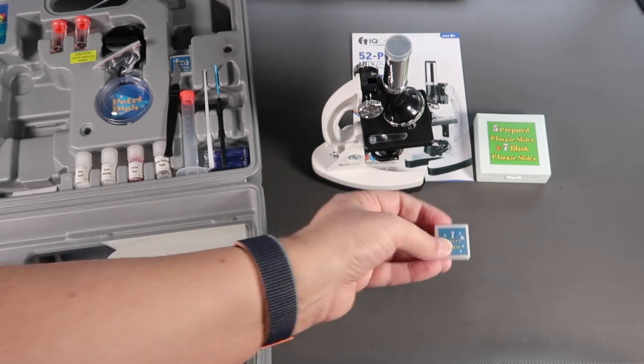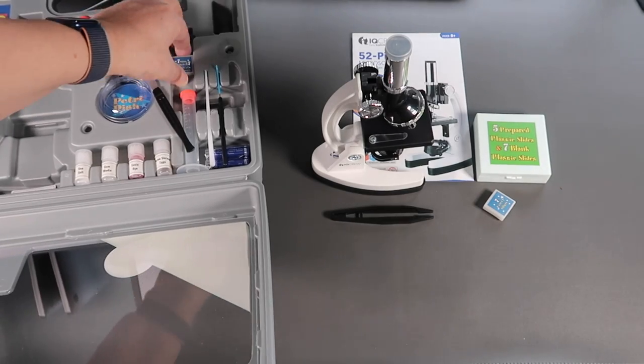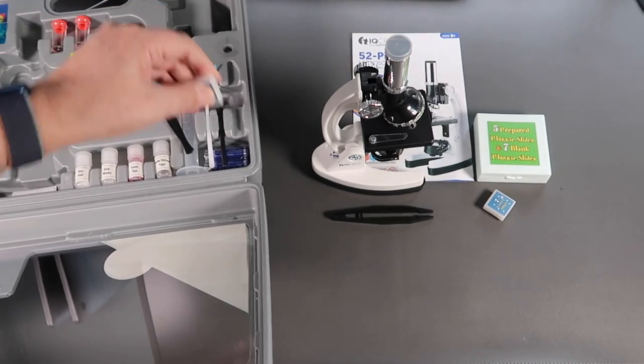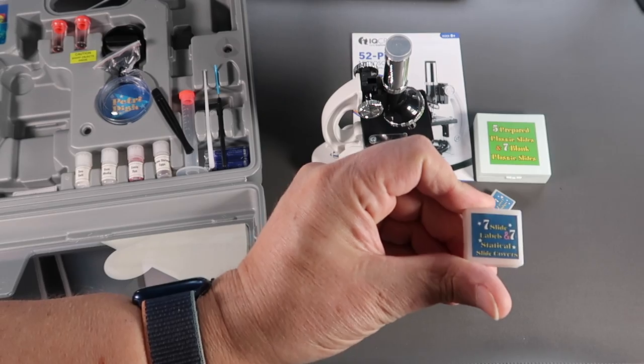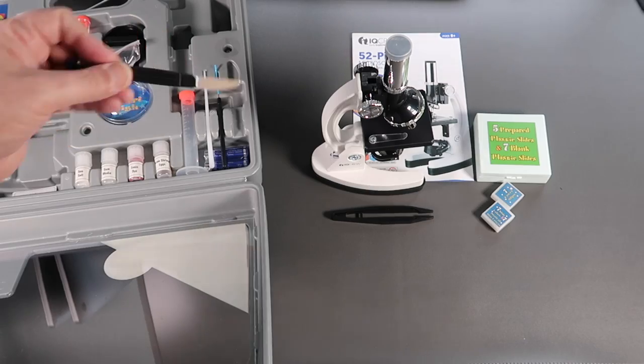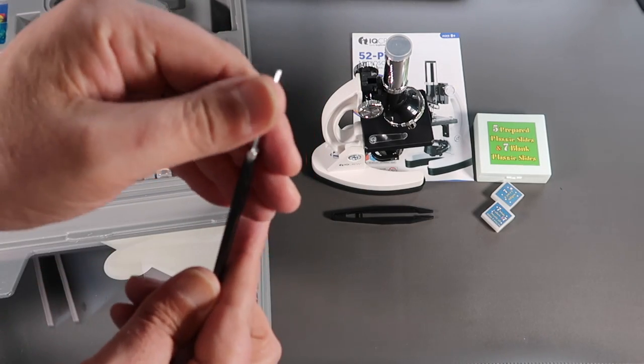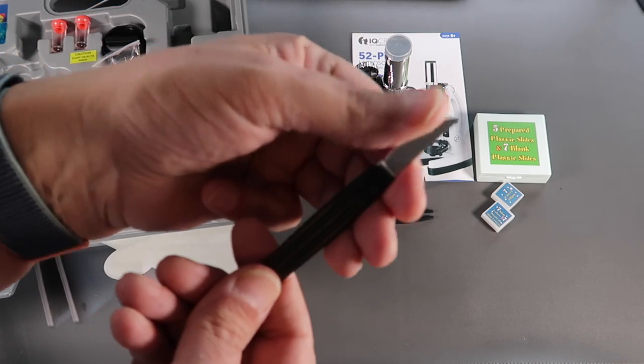Cover slips, slide labels, a little scalpel. It's not at all sharp.